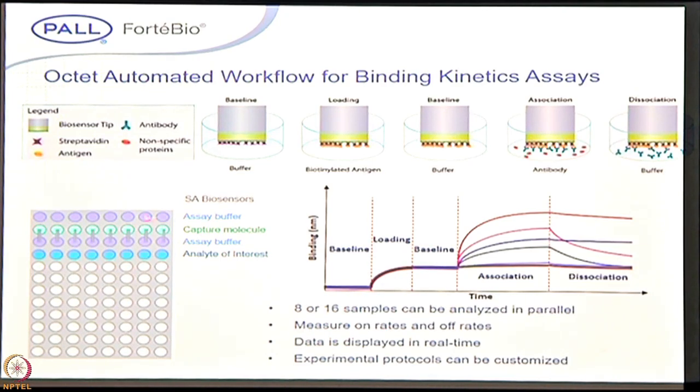When the same sensor moves back to the well containing a buffer, here it's just a baseline, there are no molecules binding, and the unbound molecules get washed off here. The sensor next moves to the well containing the analyte, and you can see the response. And the same sensor goes back to the well containing a buffer, and the bound analyte gets washed off. It's very simple to operate this experiment. You can quickly screen, and in just 15 to 20 minutes you can get the kinetics data.